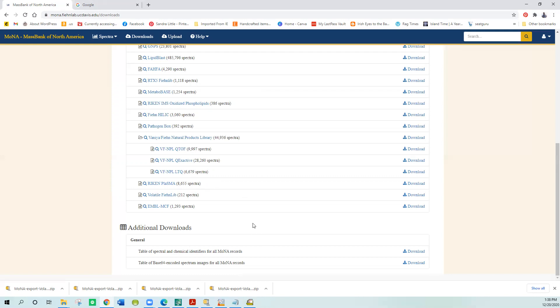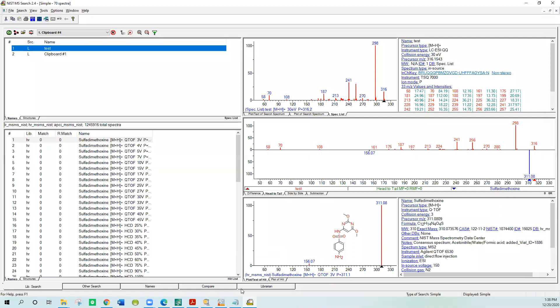The next thing I want to show you is how to create your own user library. That's another big part of the handout. I've imported the spectrum. Let's say I got it from Agilent or Thermo or some other manufacturer's data system program, and I showed you how to import in another session in the series. I imported the spectrum, so we have this that we want to add, and we think we know what it is now, and we want to add it to our library.